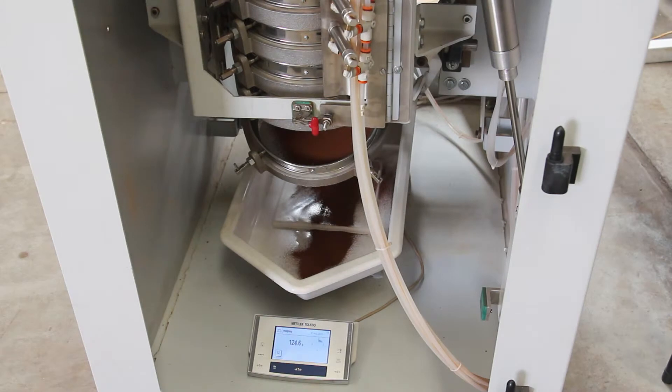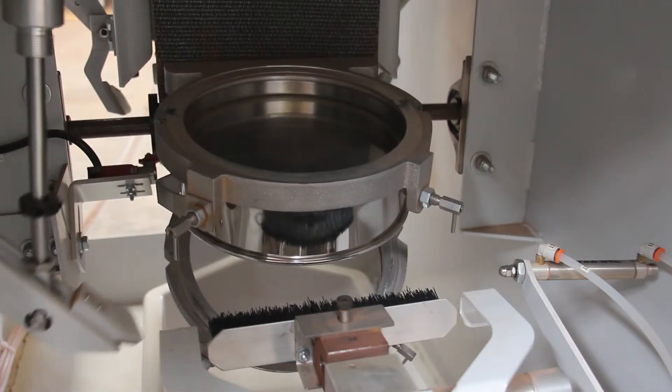Each sieve is brushed and tapped prior to the material being weighed on a precision digital balance.